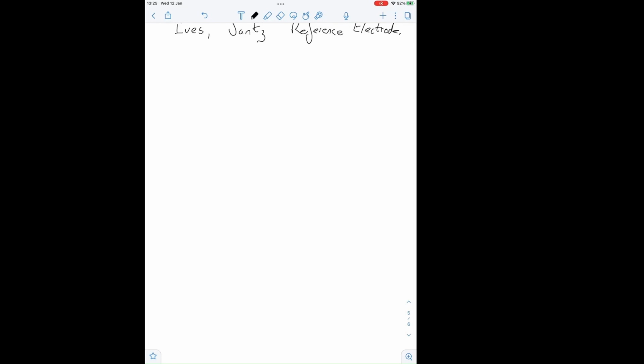One of the reasons mercury was used as an electrode in all the early electrochemical experiments wasn't that it was a nice liquid, although it's atomically smooth because it's a liquid, so that helps. But actually, it's because you could triple distill mercury.